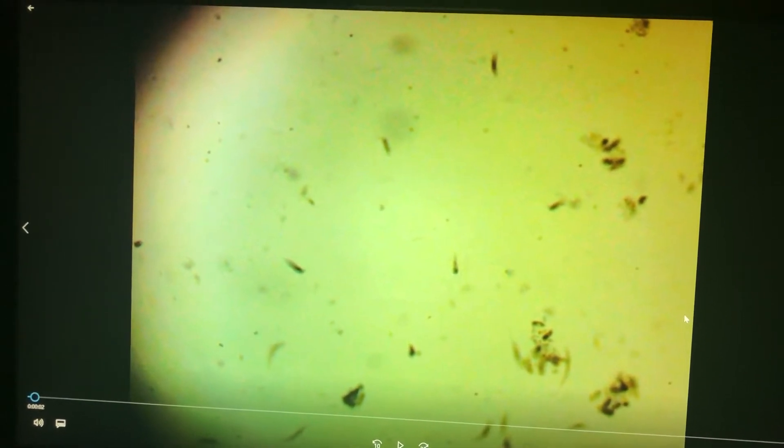I bought the microscope, put the corals that were dying under it, and saw these little guys crawling around on the skeleton where the tissue was being eaten. I placed a few coral frags into about 10 mils of tank water, left it in a urine cup overnight, came back and started looking at the water itself. This is what you'll find if you do that on your own.